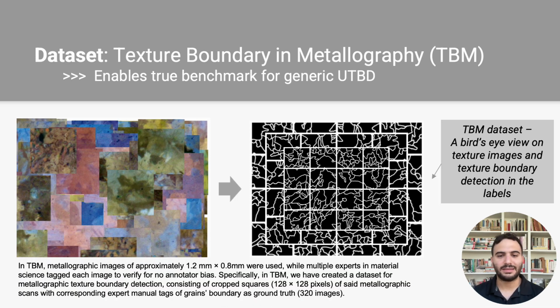This is why, aside from the common work on current relevant general image segmentation datasets, such as BSDS, we construct a new dataset, namely Texture Boundary in Metallography, or TBM, that is as general as possible with annotation that corresponds to the task of texture boundary detection in microscopy and especially in metallography. This dataset serves as a benchmark for our research and the following future work that establishes the direct contribution to the needed sciences.